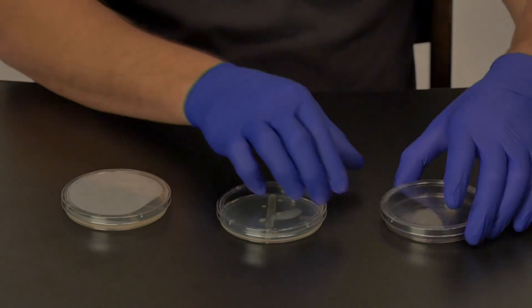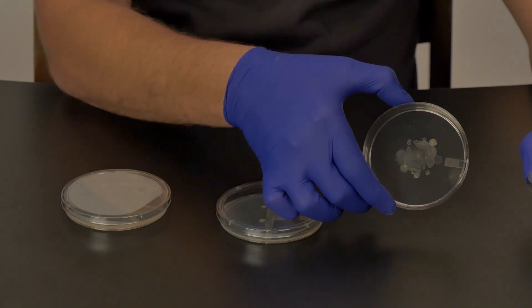For lack of a better name, I call the first method patch-proof plating. On the plate, you will spread your escape pathogen that you used for the spread plating method. Let me remind you that I will refer to it as the escape pathogen, when in reality we only used the safe relatives of each pathogen in lab.